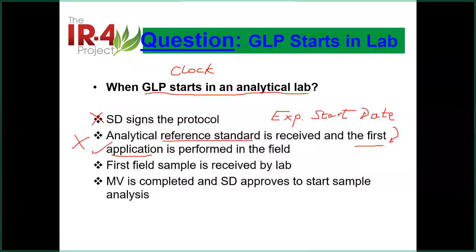We don't do GLP because we don't know anything. So when the first sample arrived at the lab, now I have the sample. I have the standard. Is GLP started? Yes, GLP started. However, we still say this is a no because I don't have a method.